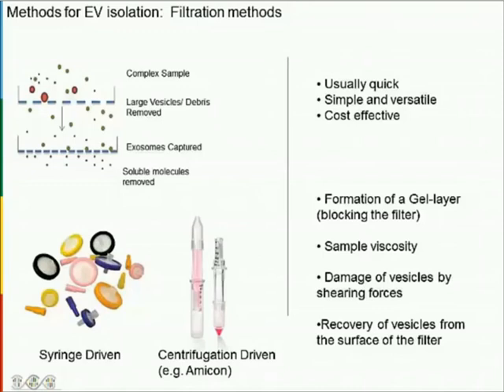If you're pushing very hard to get your sample through the filter pore, you're going to expose your vesicles to some extraordinary shearing forces, and we know that vesicles can be damaged if you're pushing them hard through filters. If you're trying to grab exosomes on the surface of the filter, it brings you extra problems in trying to recover all those exosomes efficiently from the filter. The exosomes are particularly sticky. They stick to plastics. They're bound to stick to filter membranes. So your recovery there is going to be questionable.